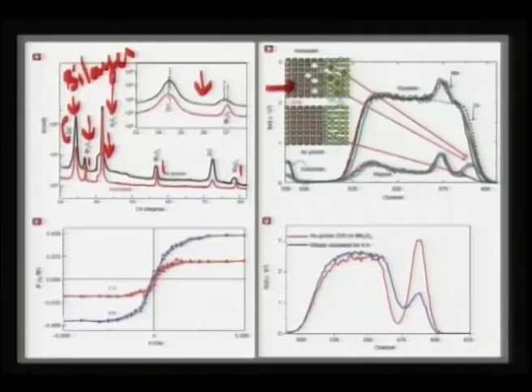Now, if you look at the RBS pattern, this is the RBS spectra, nothing but Rutherford backscattering spectrum, and this is called a channeling experiment, which will tell us whether in a zinc oxide crystal, if any impurity is doped, that would give a good channel or a disturbed channel. If the channeling value is good, then you say that there is clear doping. If a secondary phase is forming, then the channeling will be very bad, which means you are not able to grow an epitaxial layer. So, you can get a variety of information from Rutherford backscattering.